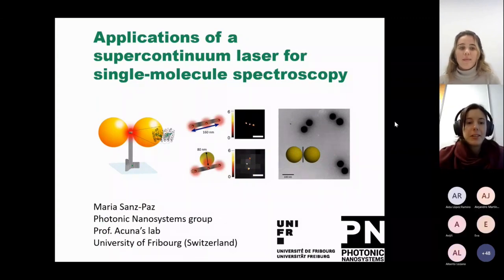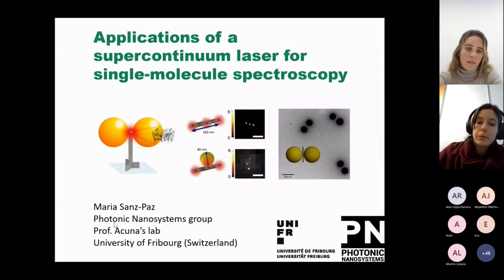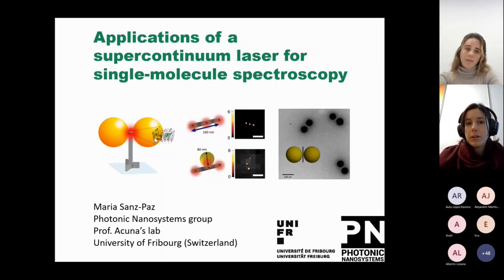Okay, so as you said, I come from the University of Freiburg in Switzerland. I work in the Photonic Nanosystems group led by Professor Acuna. And so we do single molecule spectroscopy in our lab, and I'm going to show a bit what we are doing with supercontinuum lasers.